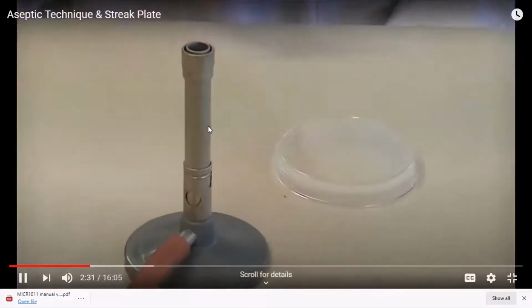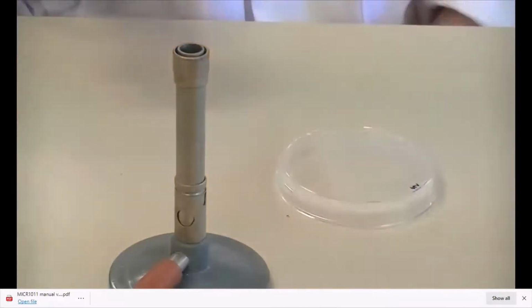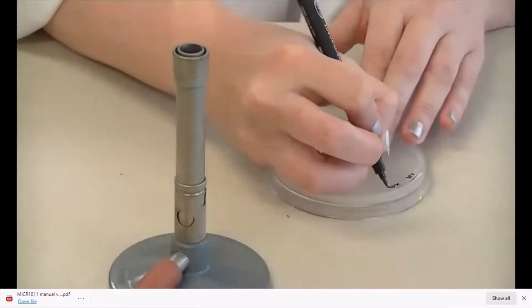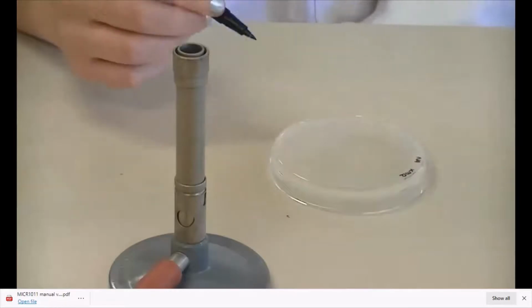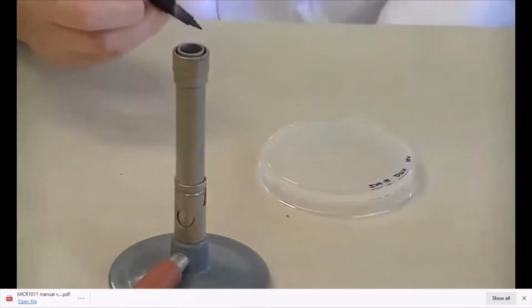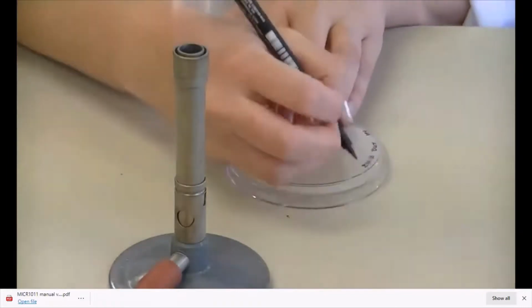Because this is a nutrient agar plate, I'm going to label the plate with NA, the abbreviation for nutrient agar, and you should also include your initials from your first name, your middle name and your last name. In this example, I'm transferring E. coli, so you can write the organism name, or you could write the exercise number that this plate refers to. You must also include the date in your labelling.